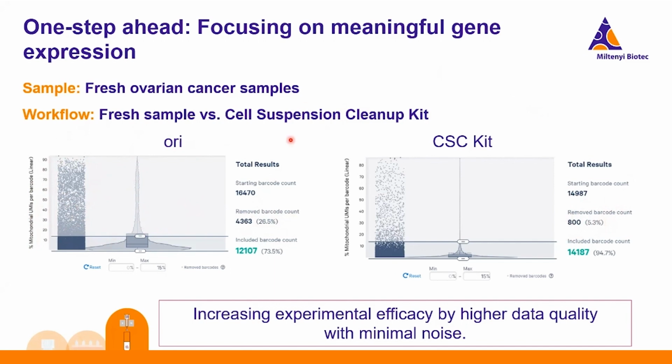And this is also reflected in your reads, right? There are a lot of reads which you are filtering out at that step, which are not useful data anymore. So you're not using them on regions which are of interest and relevance, but they are trapped in data which you are filtering out later anyhow.